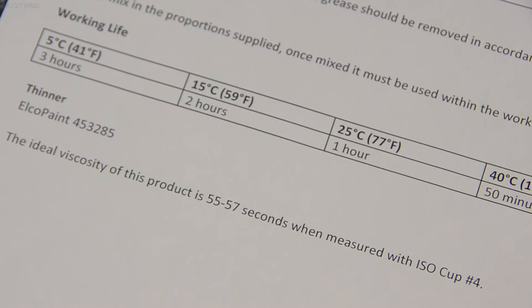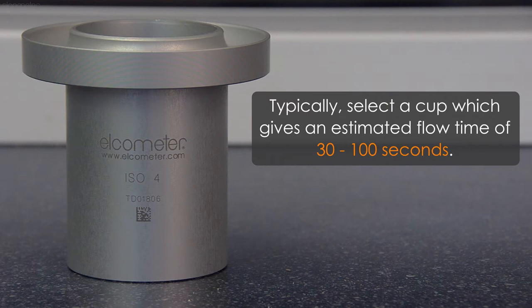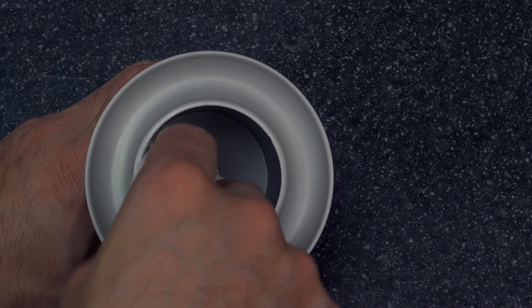With many different designs available, which flow cup should you choose? If a preferred flow cup isn't listed on the technical data sheet of the liquid you're testing, then typically you should select a cup that will give an estimated flow time of between 30 and 100 seconds. However, this is dependent on the range of the flow cup you're testing with, or the test method or standard you're working to.